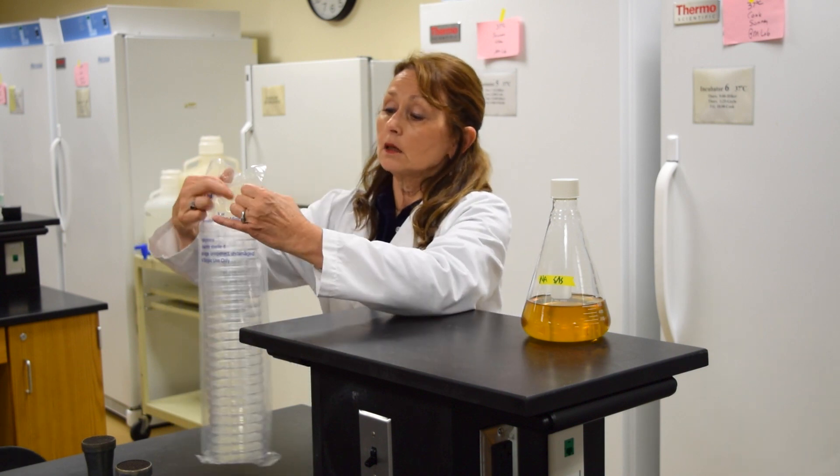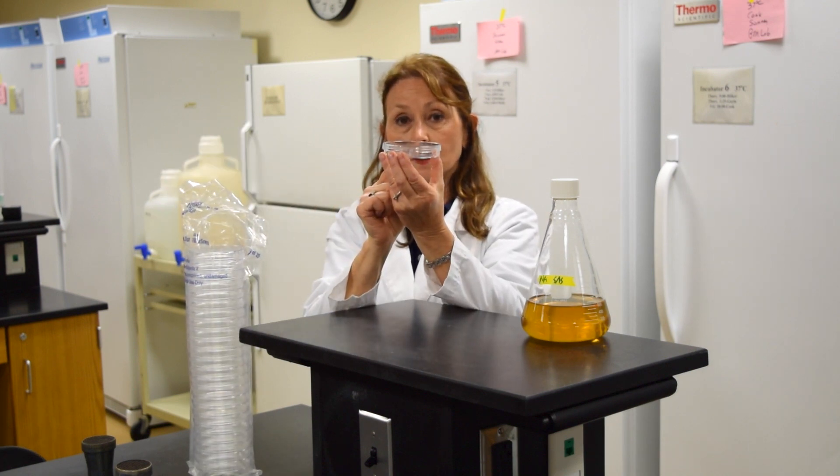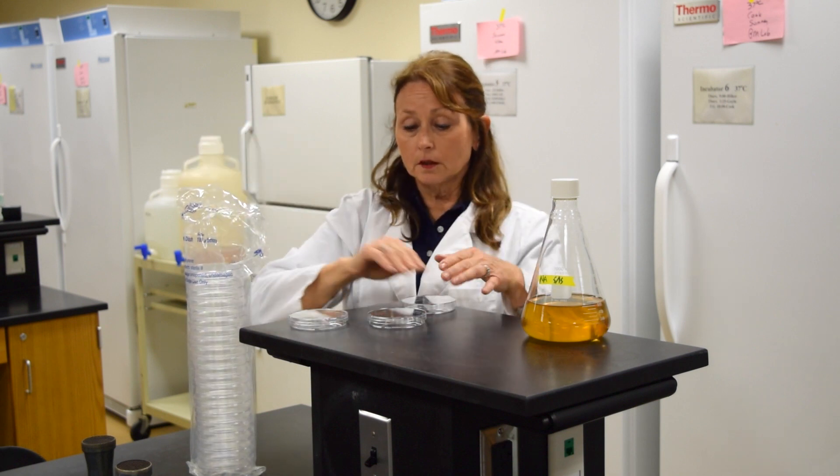Start by taking the plates that you need out of the bag. The lid will go over the top of the bottom of the plate. Take out the necessary plates, but do not remove the lids while you're taking the plates out of the bag.